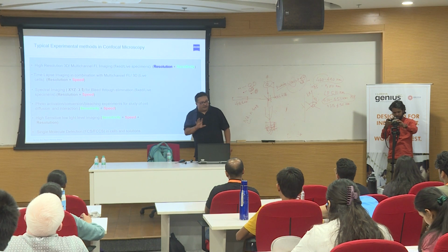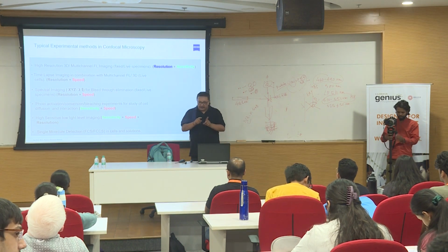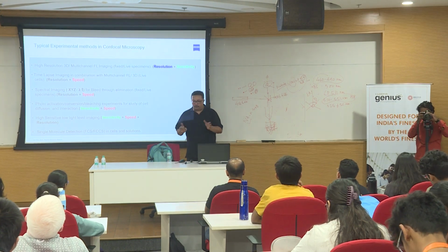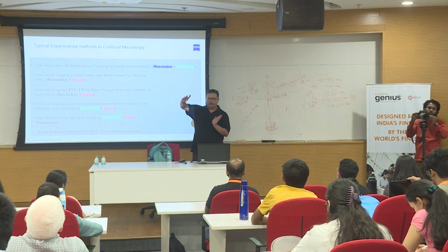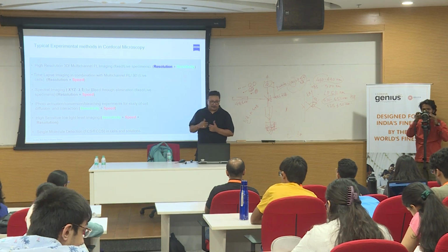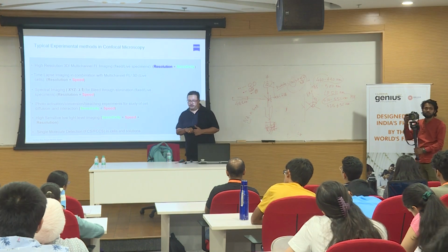Clear? So whenever you acquire an image, you will always define your image with respect to bit depth and grayscale values. And these 0 to 255 are nothing but pixel intensities, or grayscale values. So if you have an 8-bit image, the maximum grayscale value is from 0 to 255, right or wrong? Anything more than 255 is not 8-bit. It goes beyond the scale, which you cannot quantify or resolve. Anything less than 0, can you quantify?